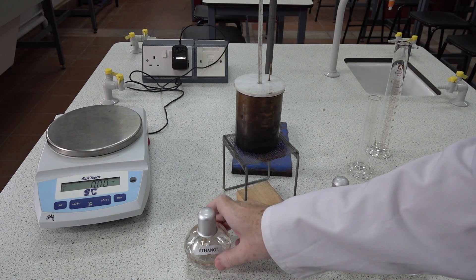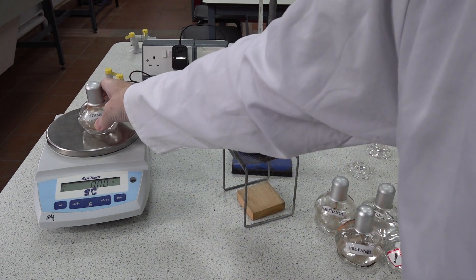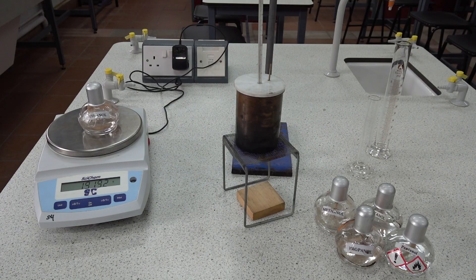Let's take another reading for the mass of the spirit burner. That's now 191.92 grams.